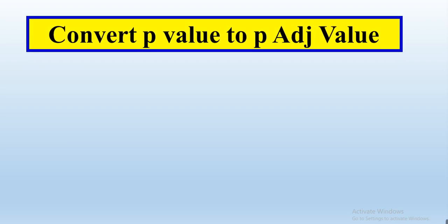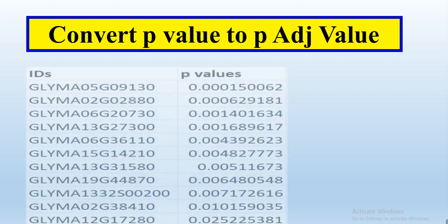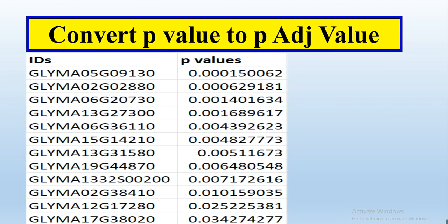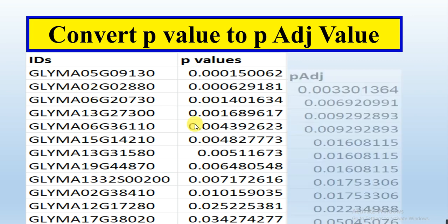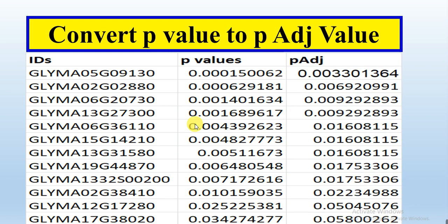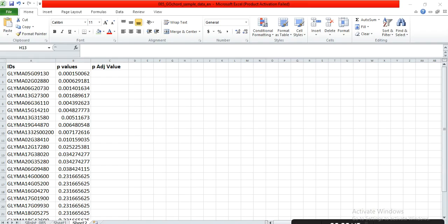In this video, we will learn how we can convert the p-values of our experiment to p-adjusted values. I have these IDs which are my genes, and this is their p-value that was obtained from our expression data or from RNA-seq data. I want to convert this p-value into p-adjusted value.